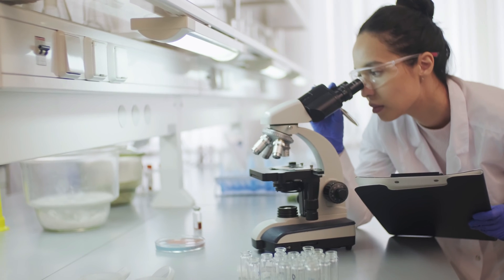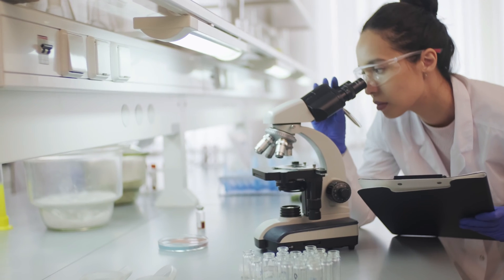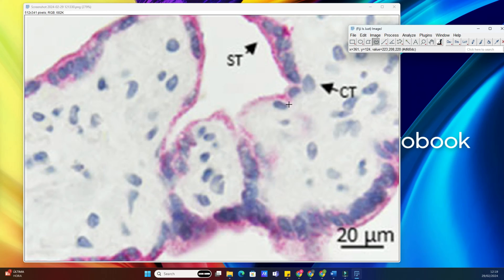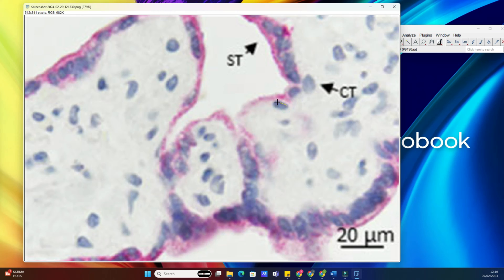First things first, fire up your image software and open the image you want to work with. Here, I have an image of some cells under a microscope. Now, let's say we want to select multiple nuclei for analysis. We could go about this one nucleus at a time, but that's not very efficient, is it? Instead, let me show you a quicker way.